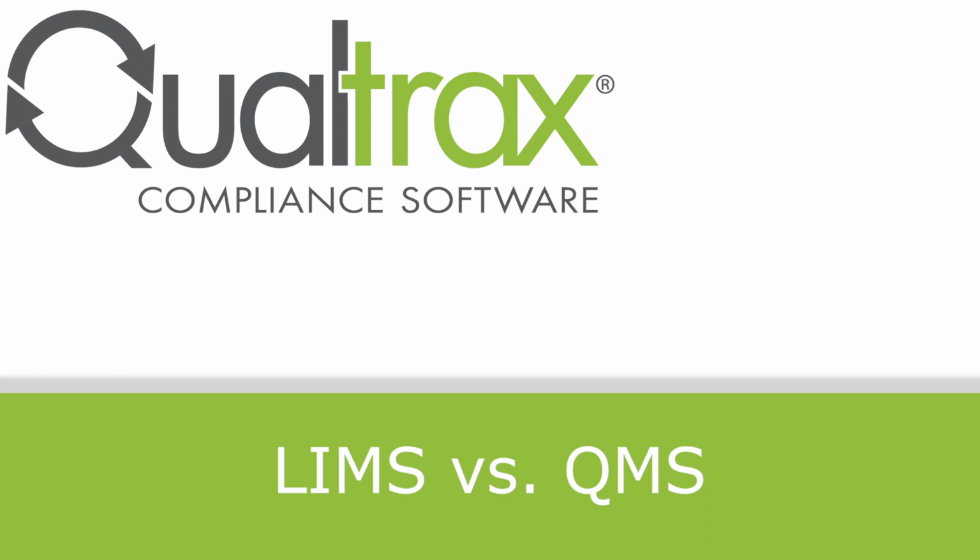Laboratories are typically audited annually by third-party auditors that represent various quality or government organizations. Audits can be very time-consuming and stressful. Having both of these systems in place during an audit is beneficial. During an audit, you're going to be asked to provide a master control document list along with all the current standards and their associated standard operating procedures. These are housed and controlled in your quality management system.